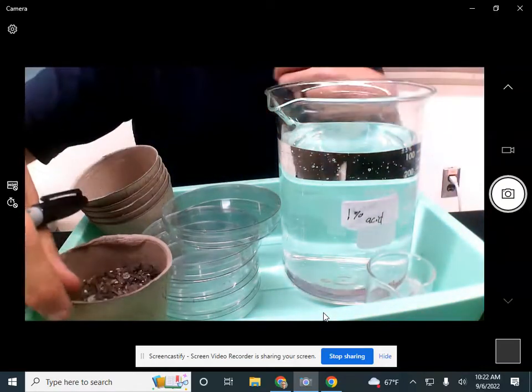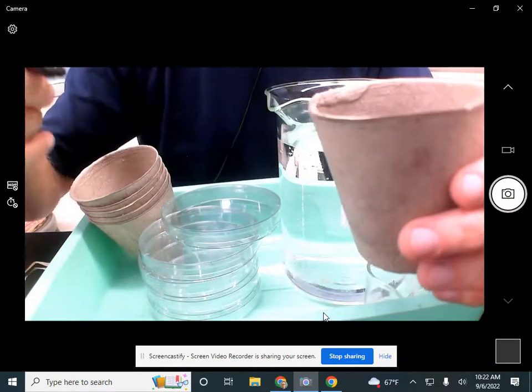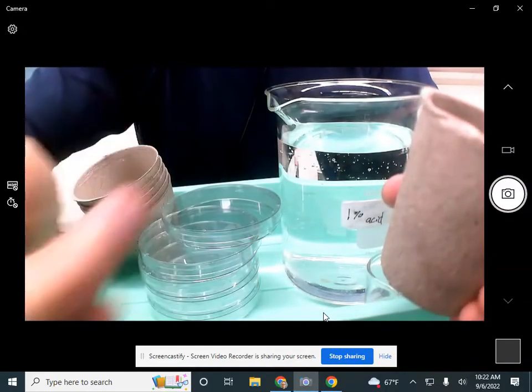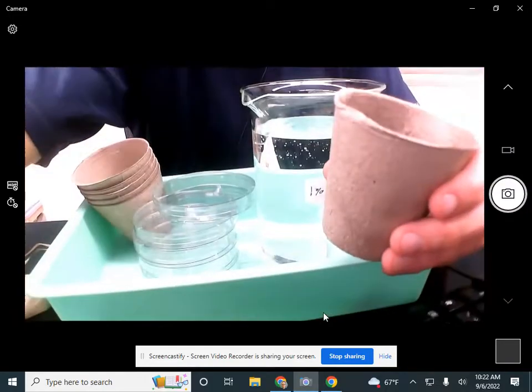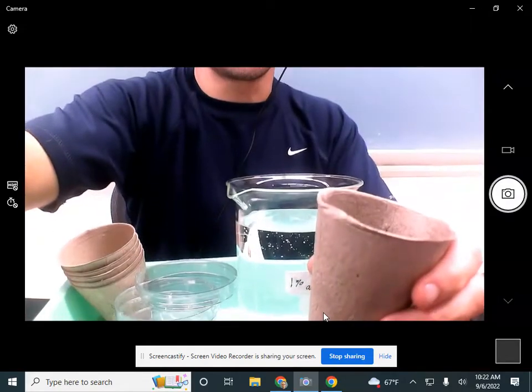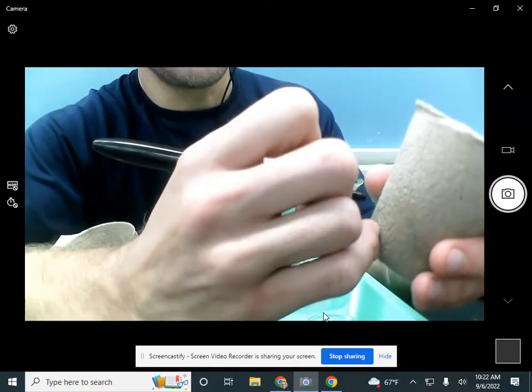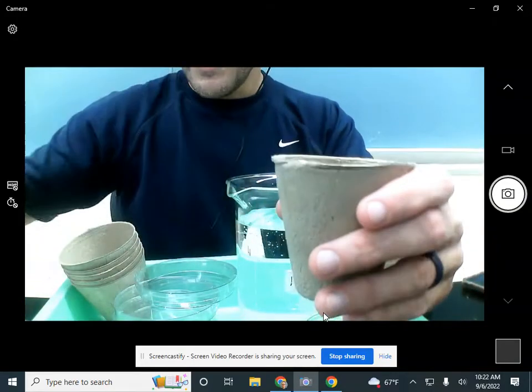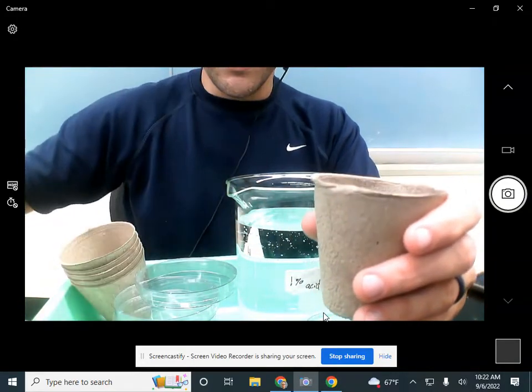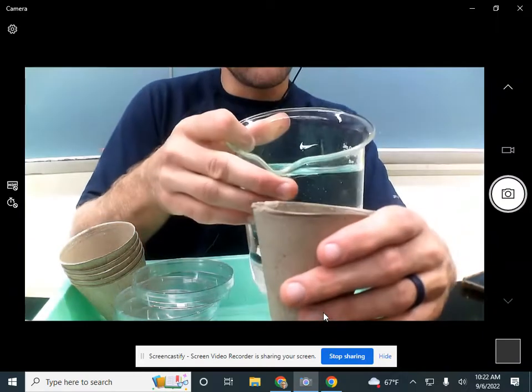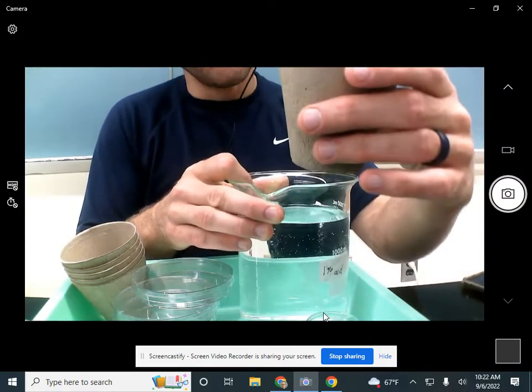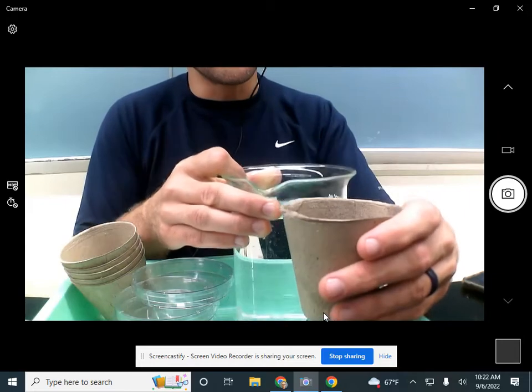With your pot, I got ahead of myself just a little bit. That's why you're watching this first. It's easier to write on your pot before you water it because once it's wet, it's not going to stick. So again, I could put Mr. R, 1% acid, put everybody else's initials, put what mod I'm in, and then use your liquid to water that. It's going to flow out of the bottom, so maybe you hold it over your bin as you do that.